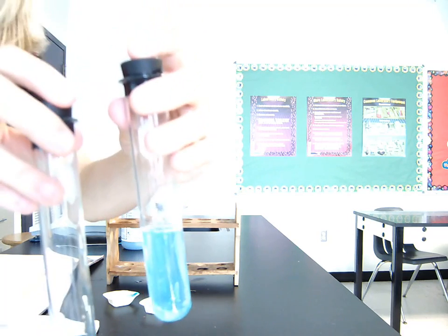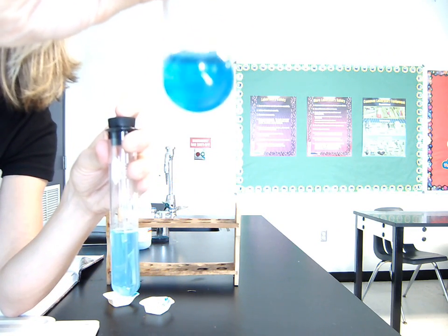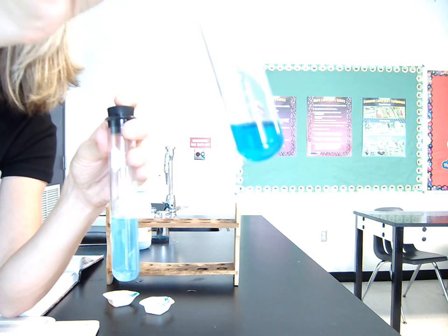All right, so let's see if we can get a good background here. You can tell, first of all, that the colors are different. And I guess we'll get to that in a second. The first thing, let's see if you can tell on the video. I don't know if you can see it or not, but all of the blue stuff is dissolved. And in the 20 cubic centimeter solution, it's all dissolved as well. There's none left in there undissolved.